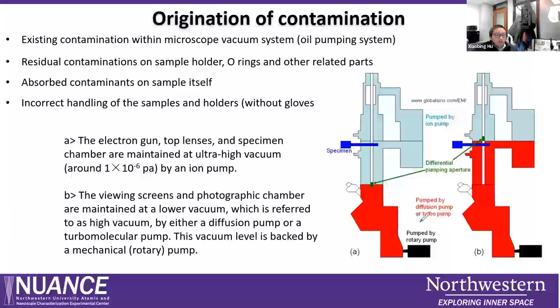So of course, you can exchange this pump from an oil pump to a turbo molecular pump, but by doing this, you will increase the cost of your microscope. That's why many of the TEMs, also including ours, belong to the second situation. I mean, in this area we use an oil diffusion pump. That's why our vacuum system is not a perfect case, but it's fine. We can still use it. If you really want to keep a very high vacuum, you cannot use an oil diffusion pump here.